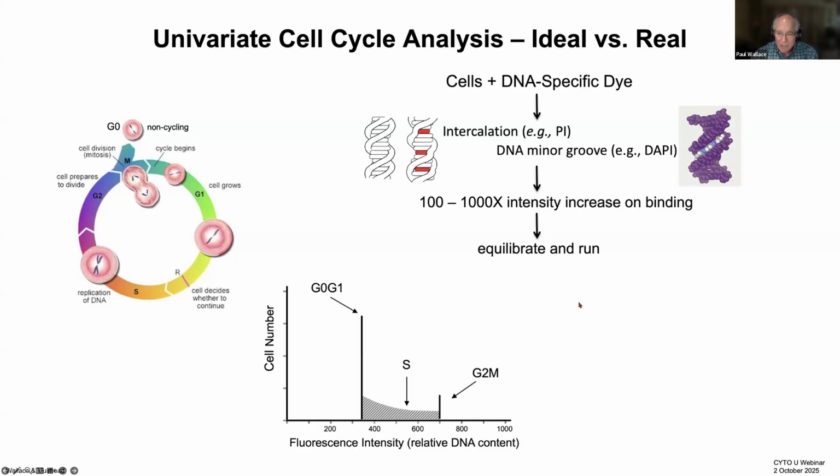Of course, that's not what we ever see. We could identify and then quantify the percent of cells in S phase by simply putting analysis regions to define that region. If we had mixed a second aliquot, shown here in red, of normal cells, and I typically use quiescent lymphocytes, having a diploid content, we would also determine where that population fell, and that would be considered normal or abnormal. In this case, these cells would be hyperdiploid.